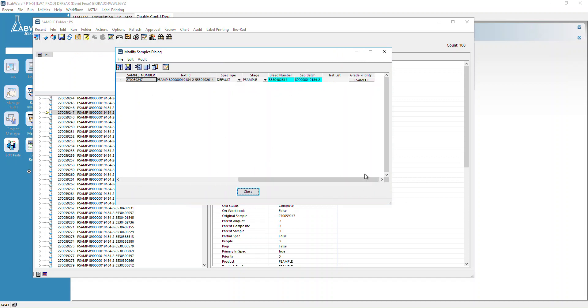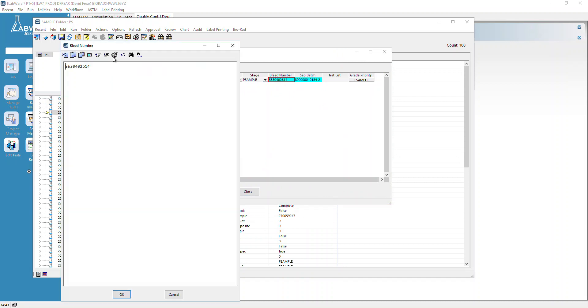We're going to say Modify Selected Samples. It's going to bring up that sample. You see it's the same one. Now I can go to my bleed record, double-click on it, and add dash-B or dash-1 or dash-something.